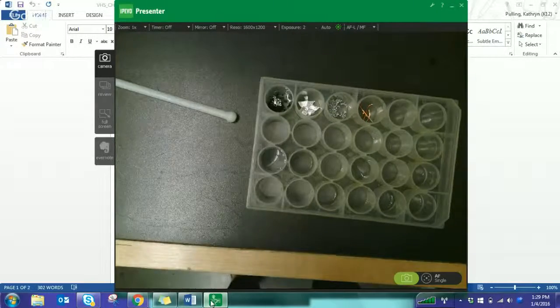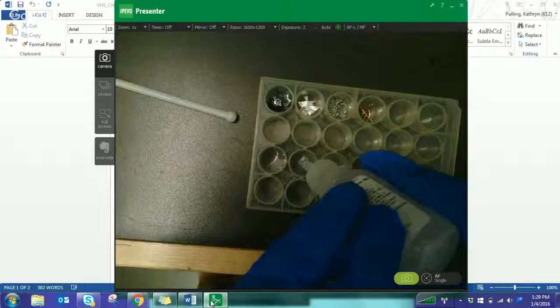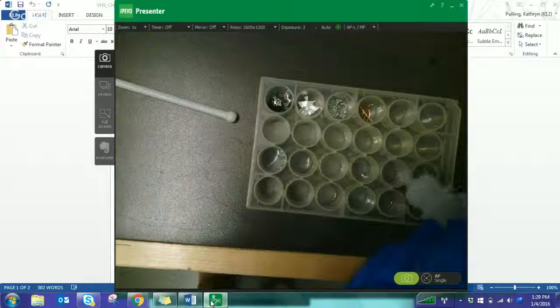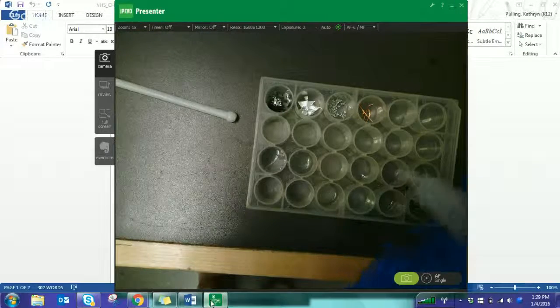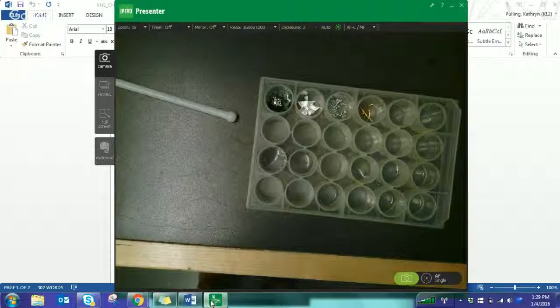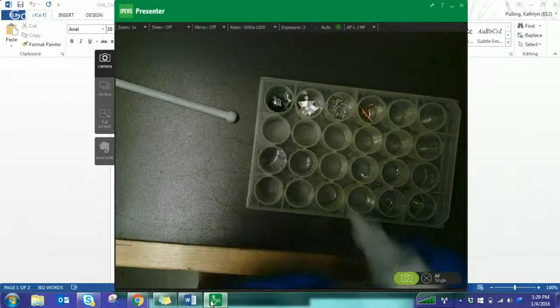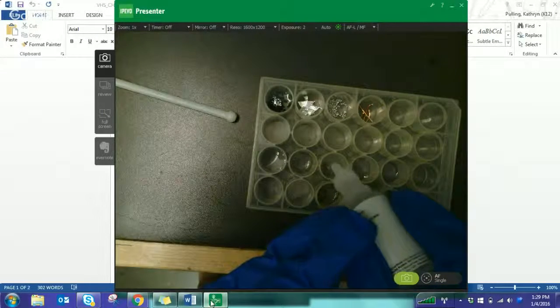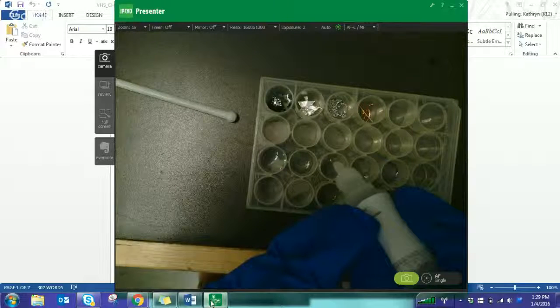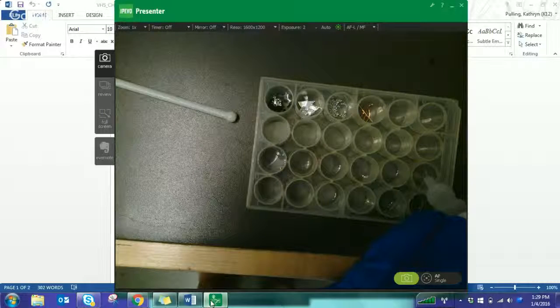All right. So in B, 10 drops, and another 10 drops. Sodium hydroxide might smell a little too, but it's not as bad as the ammonia. And last one, the dibasic sodium phosphate. 10 drops, and the last one, 10 drops.